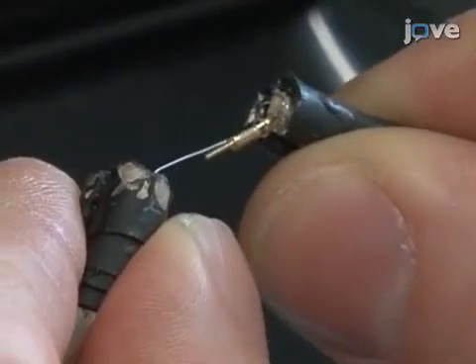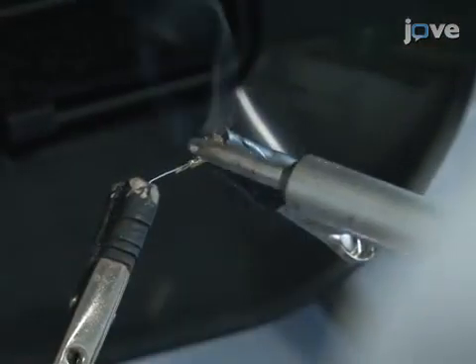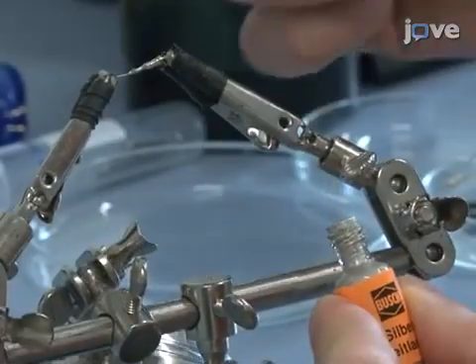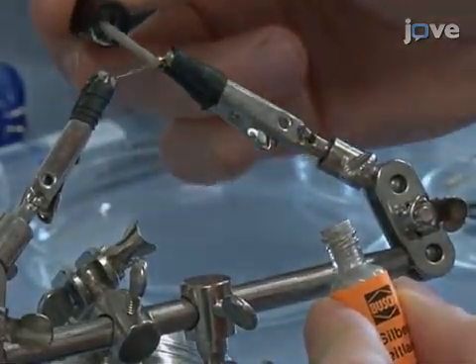Solder a precision connector to the end of the wire, which fits the electrophysiological recording system. Then, cover the soldering point from the wire end to the connector with conductive silver varnish.